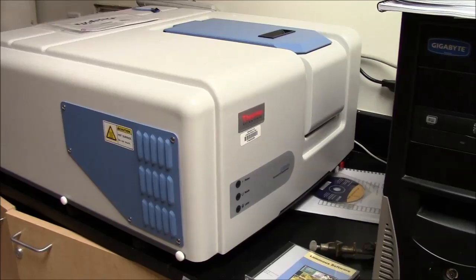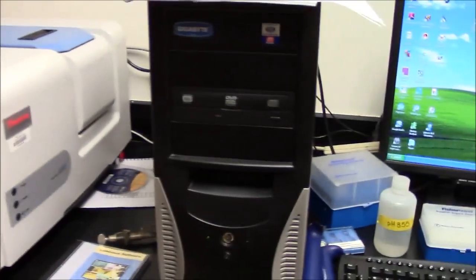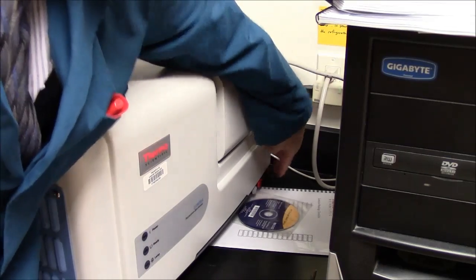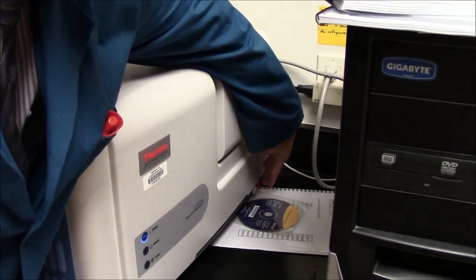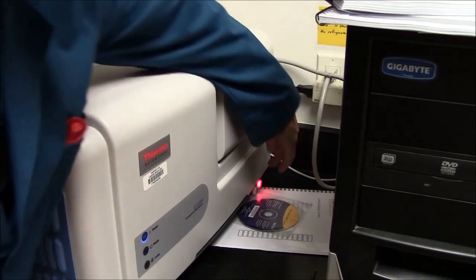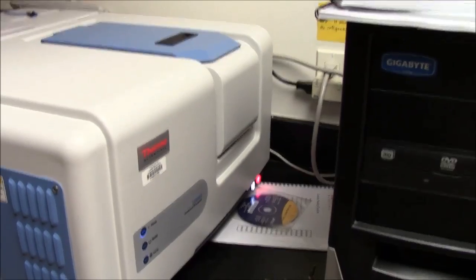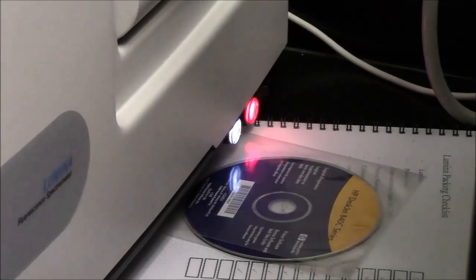Our fluorometer looks like this. It's a very big box. It's computer controlled. To turn on the machine, down here there are 3 switches which are done in order. First, the farthest one. Next, the middle one, which is red. And finally, the white one. So this is the correct starting sequence for the fluorometer, and must be done in this sequence so that you do not harm the machine.